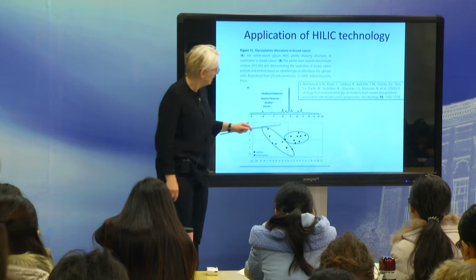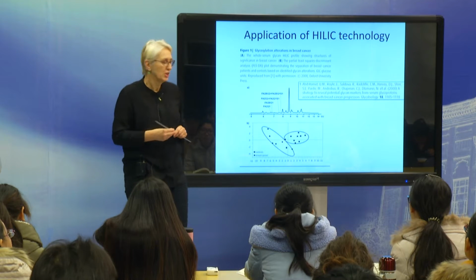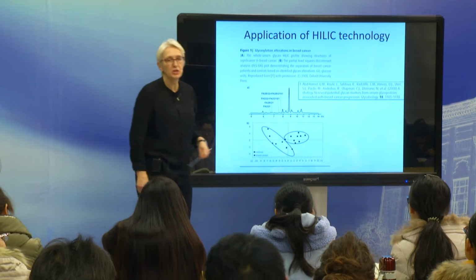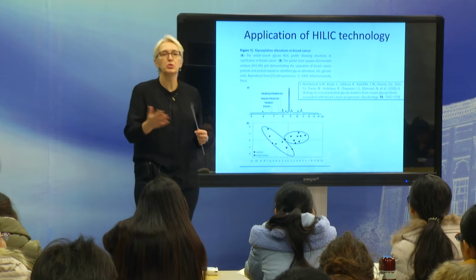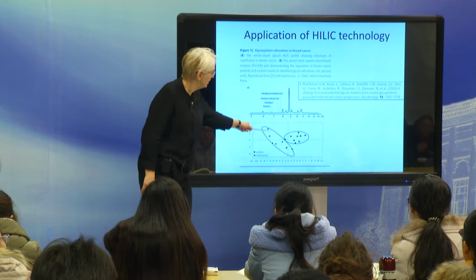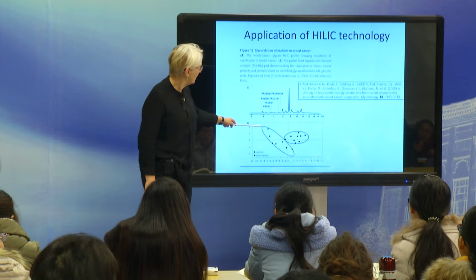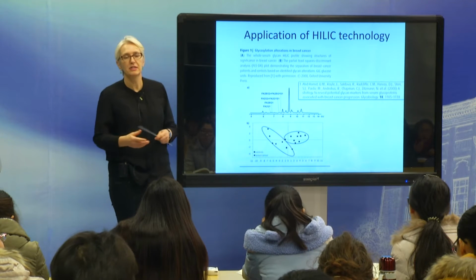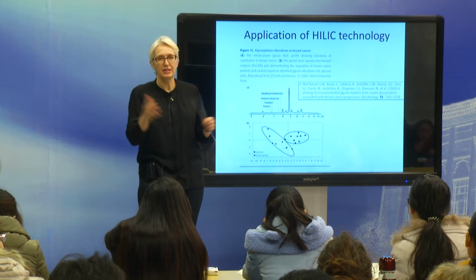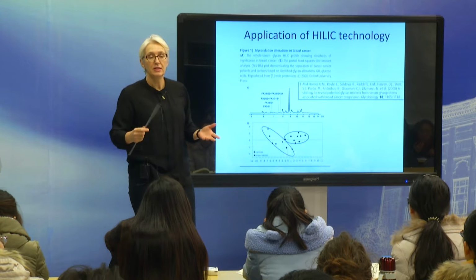And you can see what this was all based on is difference of glycosylation levels in these samples. And what they're looking at were structures here that are almost in the noise. But I think this analysis is now so precise, together with some statistical analysis, it really can generate data like that. And there are many, many examples, especially by the Rudd group, where they now have analyzed different cancer forms, ovarian cancer and so on, and shown that actually the glycosylation pattern, and this is something I said at the beginning, of cells changes during cancer.